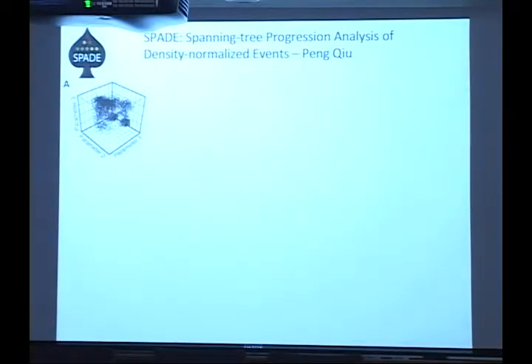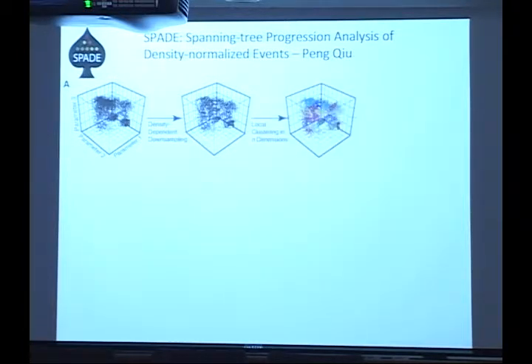So we use SPADE. Essentially, if this is a 3-parameter simplified experiment, you have areas of high density of cells, you have areas of low density. The first thing it does is even all that out by removing the high density areas. Then it clusters in n dimensions. Typically, we're using something in the teens in terms of dimensionality, just grouping like cells with other like cells. Then it takes these clusters of cells and links them together, again, like with like, attaching them to their nearest neighbors in n dimensions to create a minimum spanning tree.